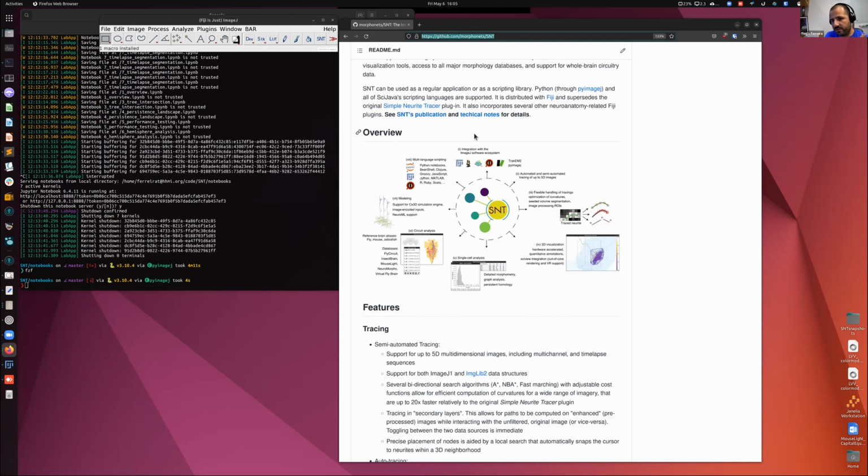That is pretty much the motivation that led a couple of years ago to start working on a more structured, organized, coherent framework where all this functionality could be present. Once we had that, we just started building up and adding more features. So this work culminated with SNT.